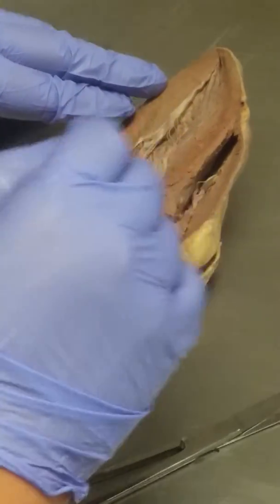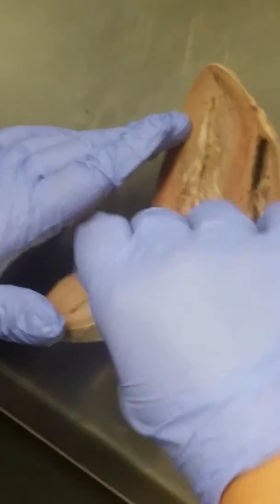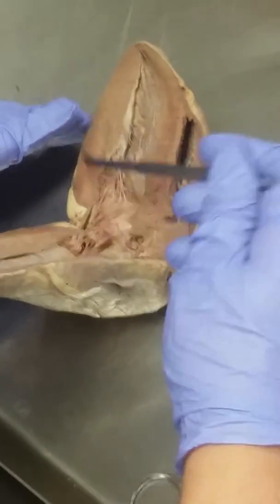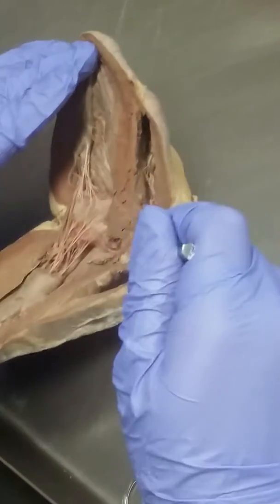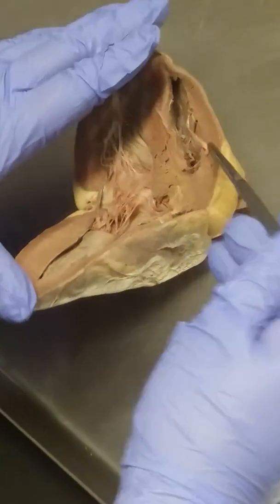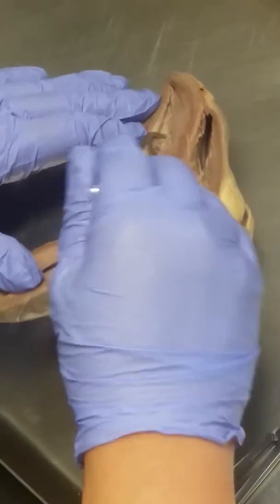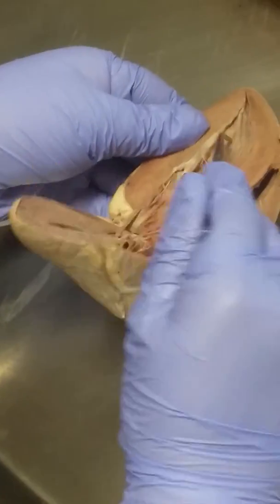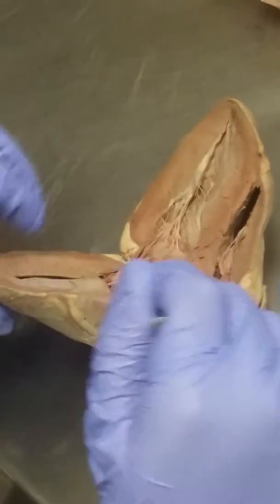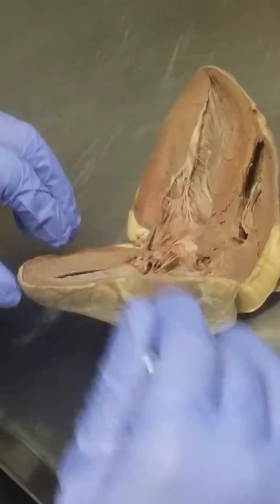What do you think that is? That's a valve. Which valve do you think that is? This is the bicuspid valve because it's on the left, right? The one over here, this valve, would be the tricuspid because it's on the right. Okay? Do you also see these little pits at the bottom? These little indentations? Trabeculae carneae, right? And do note that there's a septum that separates the ventricles from each other, right?